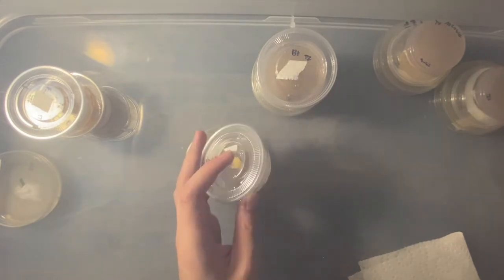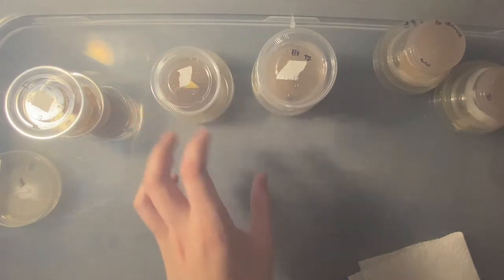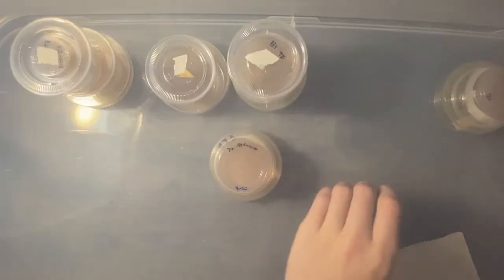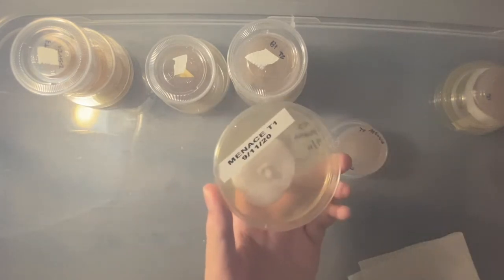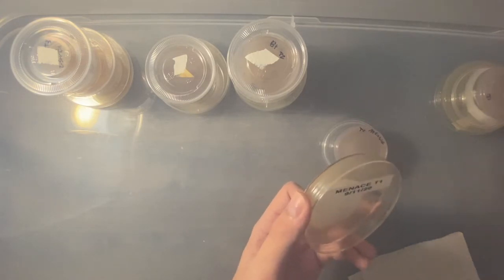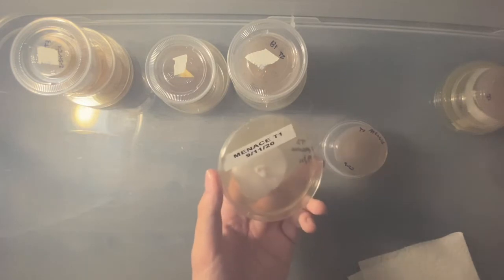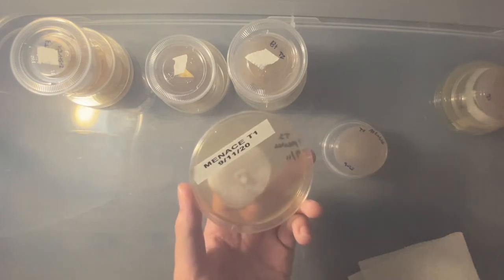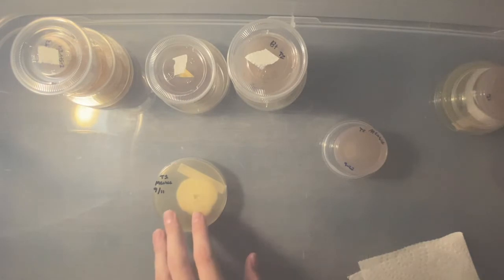Jesus Christ, that plate is thick as shit. God damn. All right, and that is some menace that I have. The growth on this menace has been very, very quick. I got the spore print for this menace maybe the beginning of this month, and I'm already going to a tier 2 transfer. Crazy growth on that menace. I can't wait to grow it out.